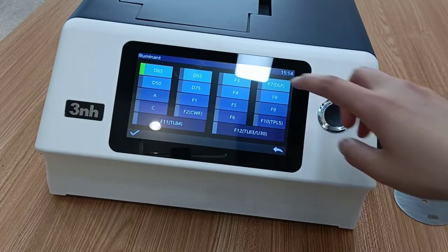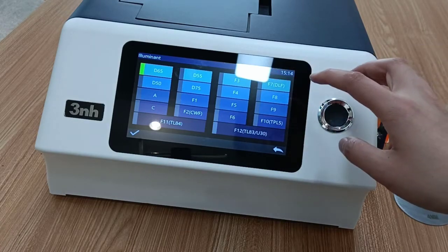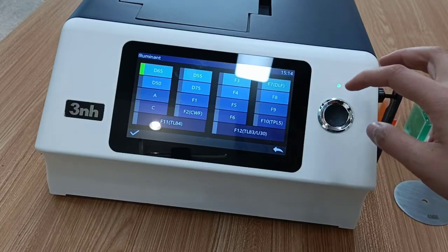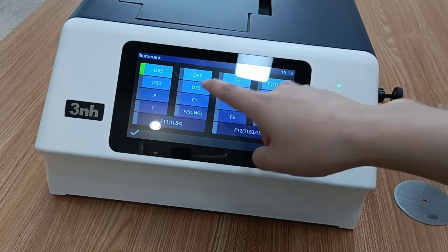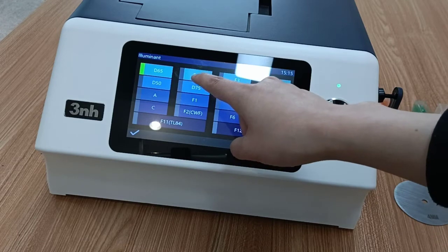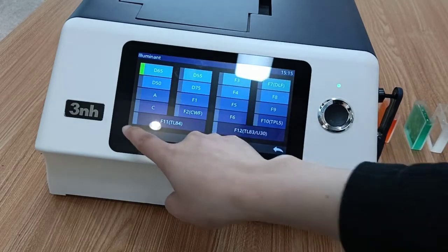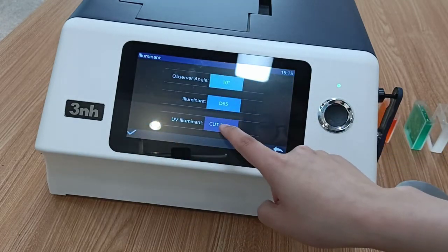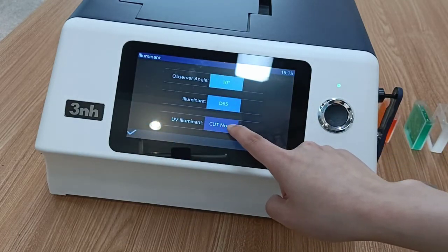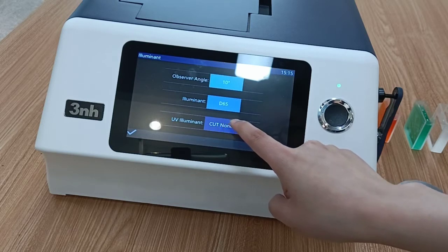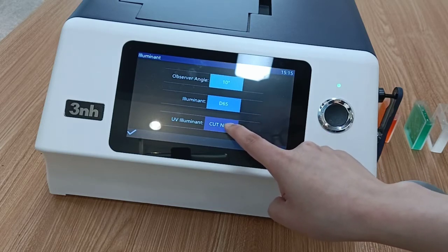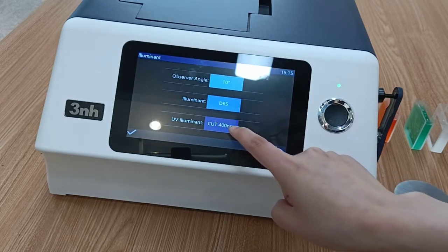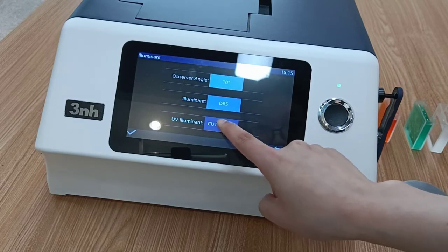The first parameter is the most frequently used of all settings, so it is listed first. UV illuminant — this feature needs to be used when the product contains a fluorescent brightener.